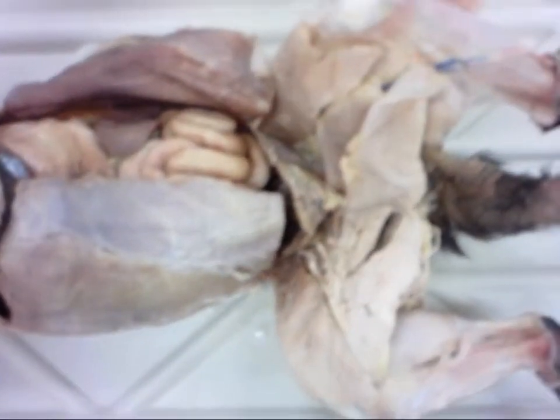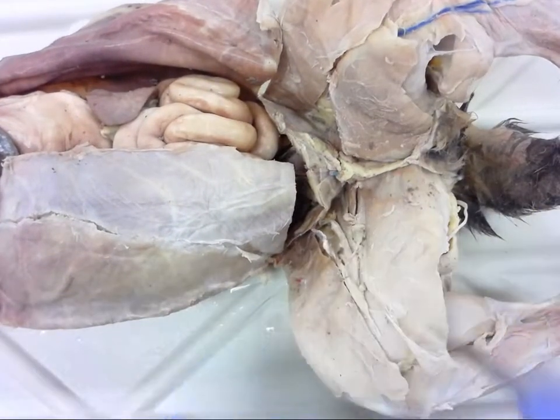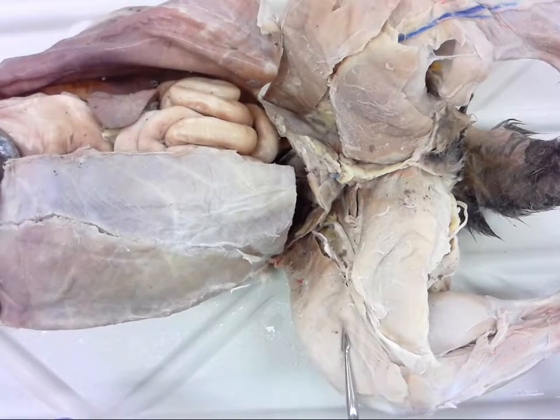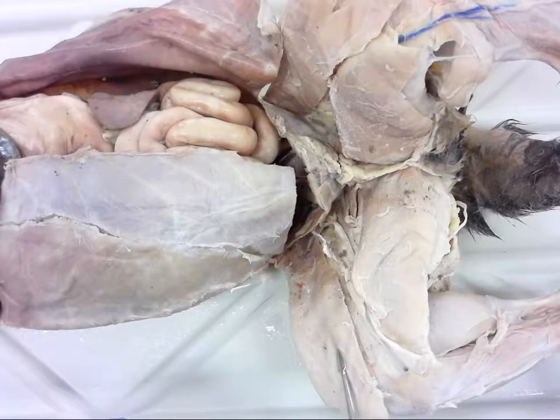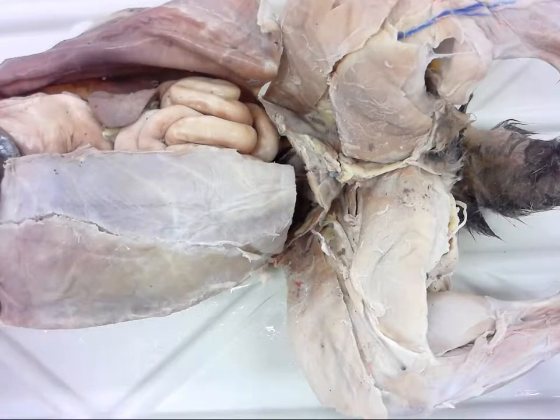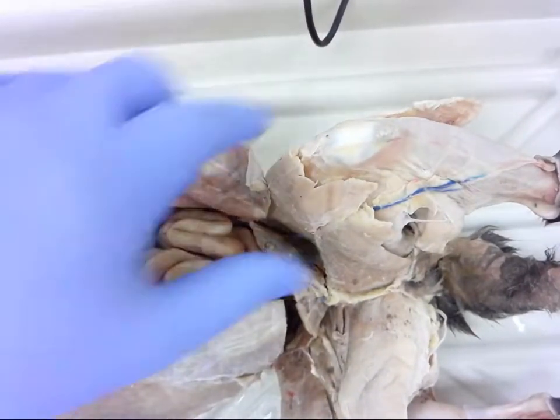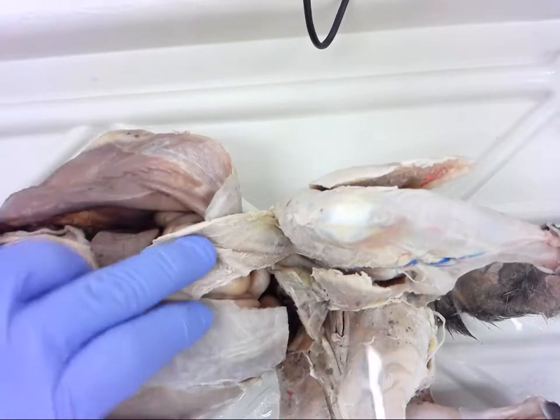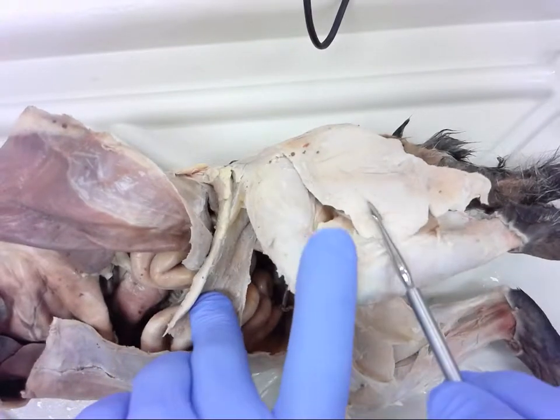Number seven, we'll move down to the lower limb. Zoom out a little bit. Looks like we have a good view on this side. Number seven is this muscle here — for reference it has been reflected. Number eight, back to the other side. It's dissected a little bit better for this one. We'll get number seven out of the way and roll to the side for number eight.